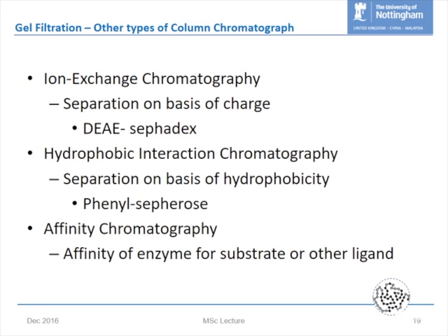And what that really does is it allows you to have, if you've seen an HPLC chromatogram, lots and lots of peaks on it, because you've got this capability to change solvent strength. We don't have any capability to do that in GPC, because we use a single concentration mobile phase. It's all based on size and shape. The consequence is that we tend to have one or two very broad peaks, pretty much what I showed you in my data. If you've seen chromatograms from the literature, you would have seen many, many peaks coming out. So the type of chromatography determines the form of the chromatograms that you get.